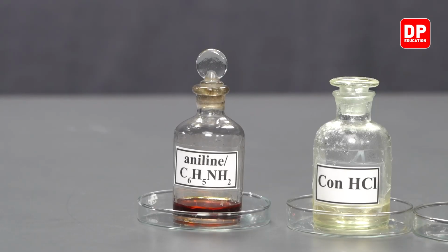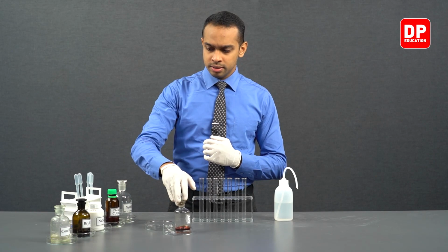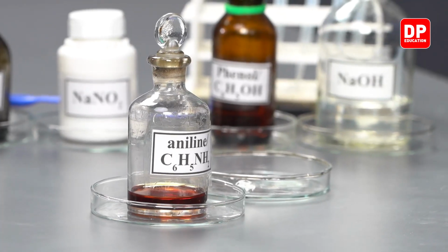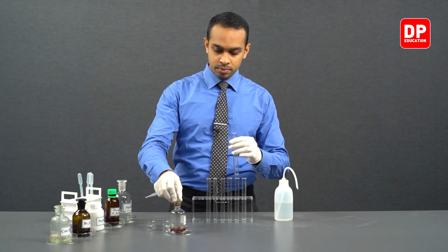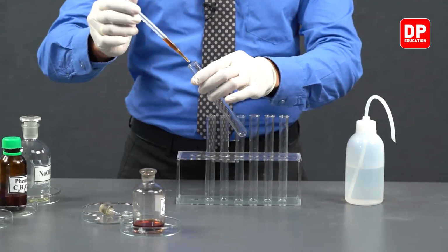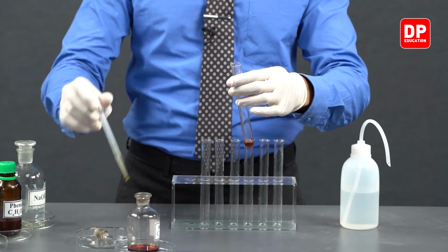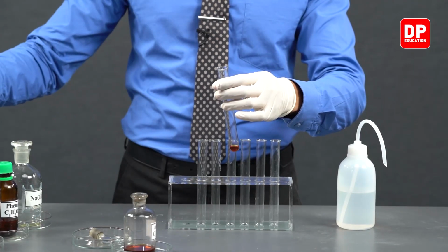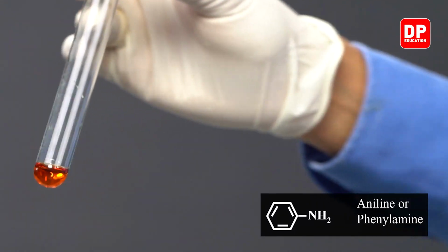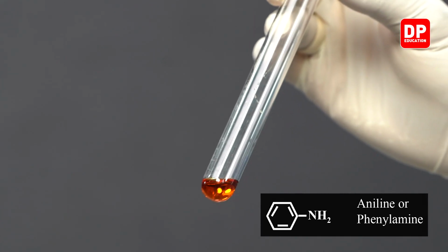Now, let's take our aniline. We have aniline over here, and we are going to add a small amount of aniline into a test tube. We can see the color of aniline ranges from yellow to orange. So this is a yellowish orange color that we see.